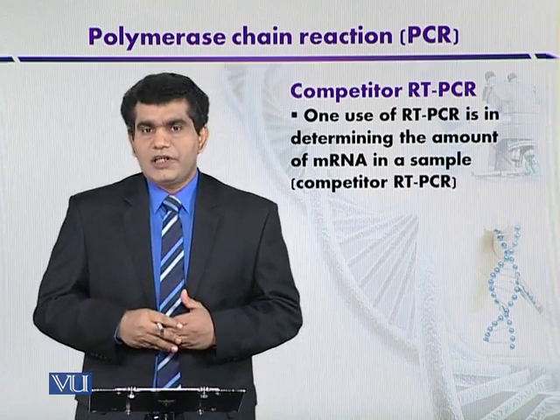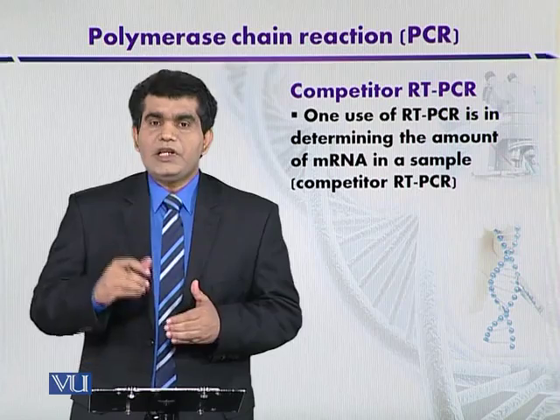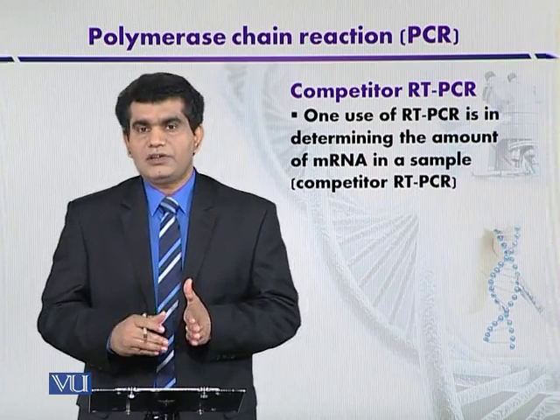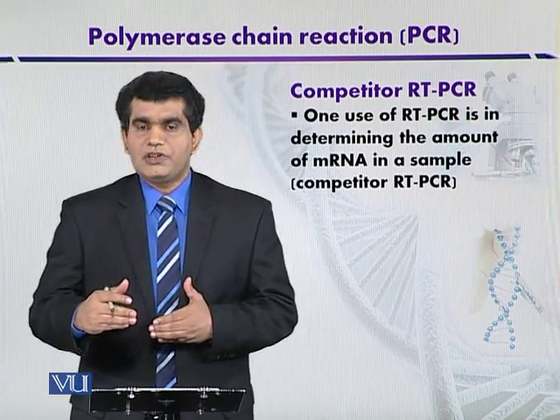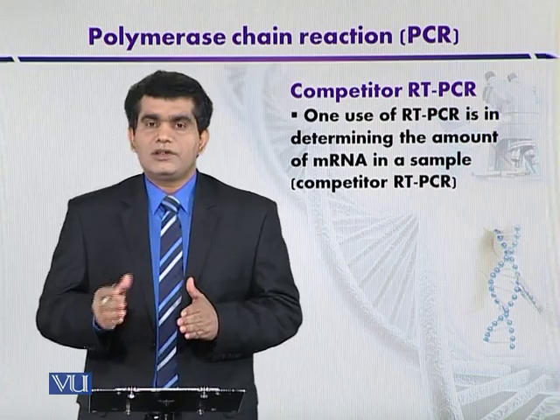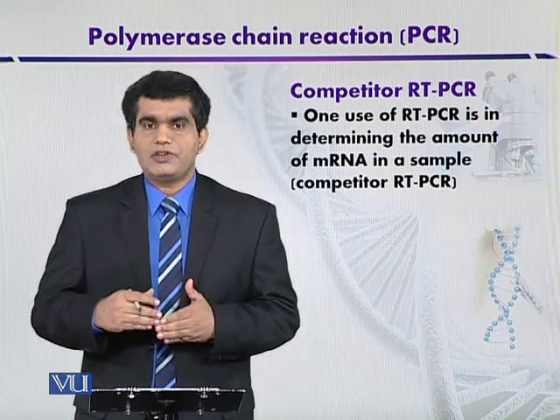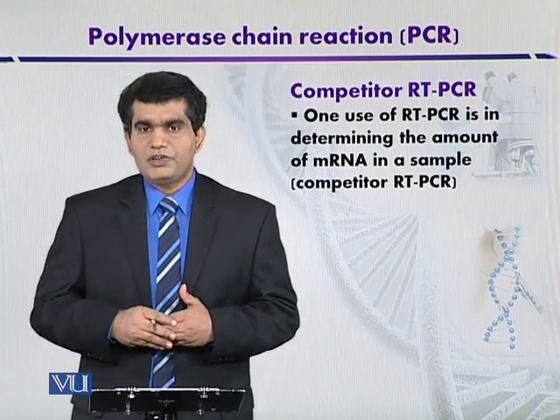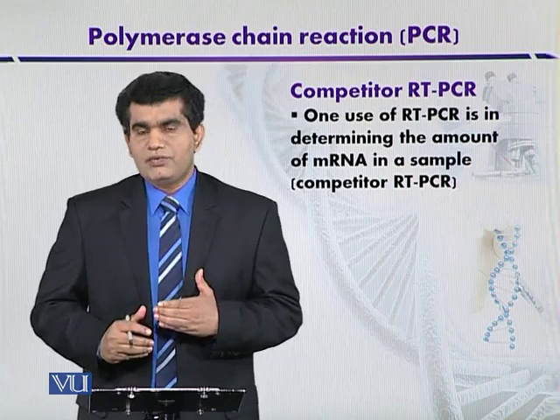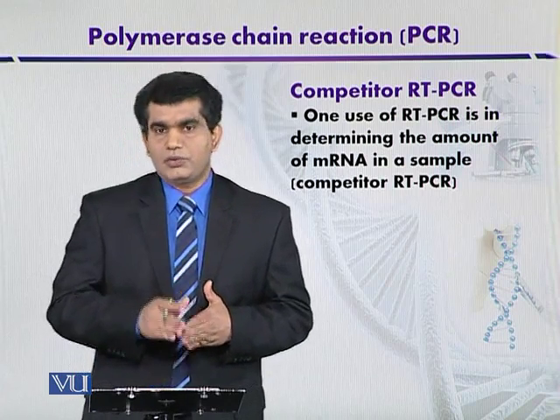Another application is that we can determine whether certain inhibitors are present during the extraction process or in the reaction mixture when we are going to conduct the PCR, because when certain RNA inhibitors are there during the extraction process or in the PCR mixture, either these may be endogenous sorts of RNA inhibitors, or it may be exogenous sorts.